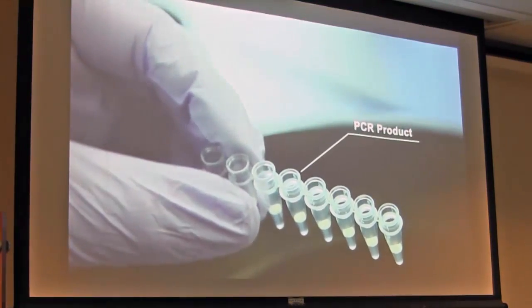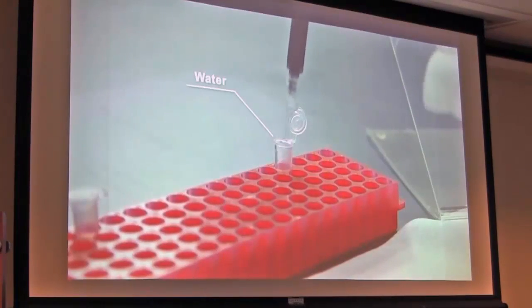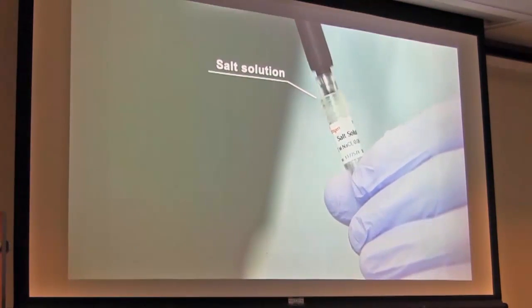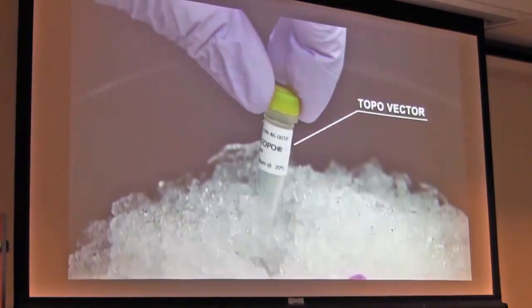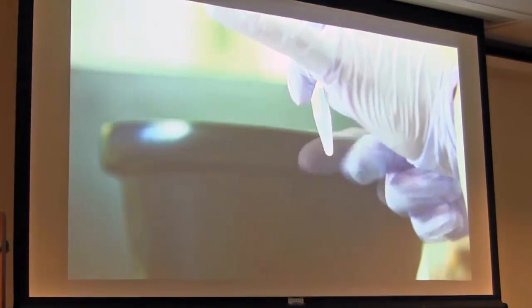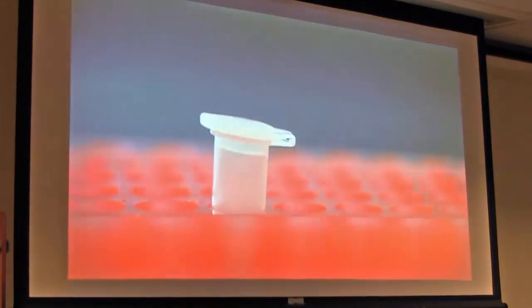He combines his PCR amplified product with the water, salt solution, and topo vector, all included in the kit, and he then mixes gently. While Jeff incubates the reaction for 5 minutes at room temperature, let's take a closer look at what's happening in the reaction.